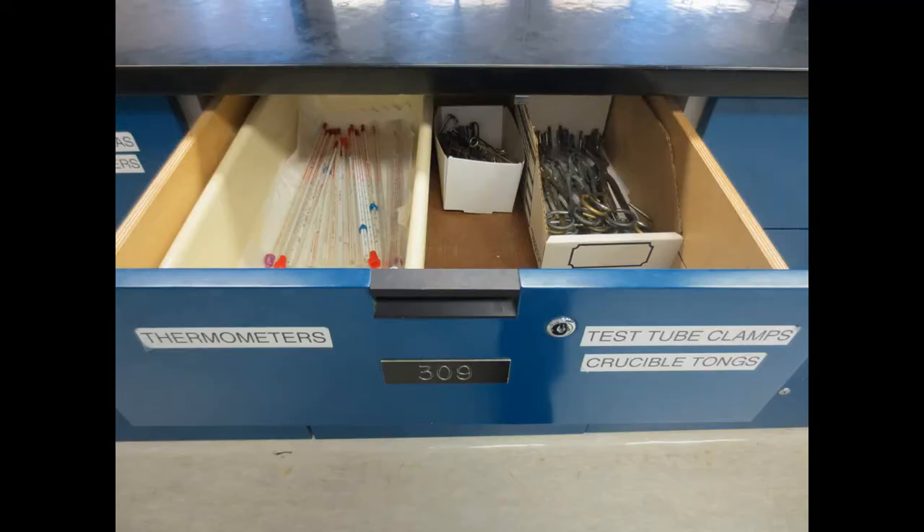Next is only one drawer, which contains a thermometer, test tube clamps, and crucible tongs.